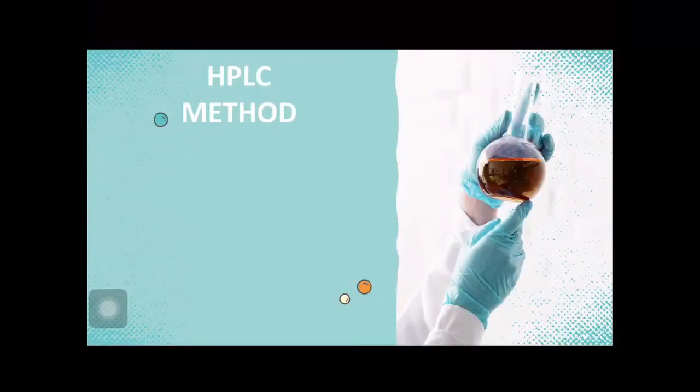Hi, my name is Muhammad Alif Iqbal. Let's proceed to the HPLC method. HPLC is a chromatographic method that is used to separate a mixture of compounds in analytical chemistry to identify, quantify, or purify the individual components of the mixture.